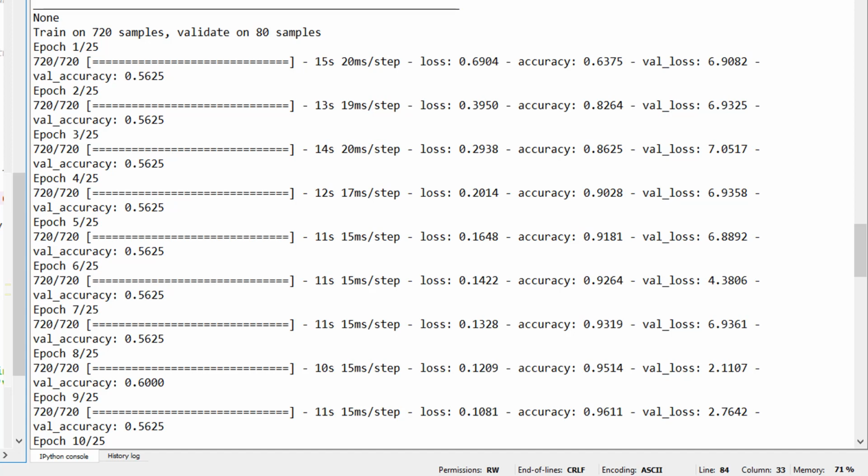And then within the 800 images, it took 10%, where we defined validation split. It held out 10%, that means 80 images, which leaves 720 images right there. So it trains on 720 samples and validates on 80 samples. In fact, there was probably no need to split my initial data set into train and test, but that's okay.